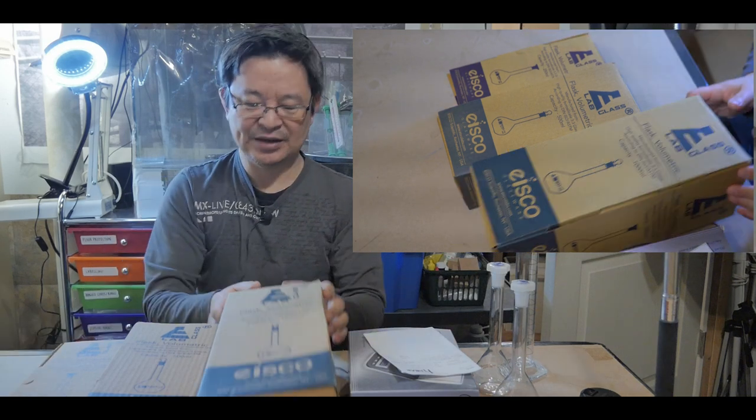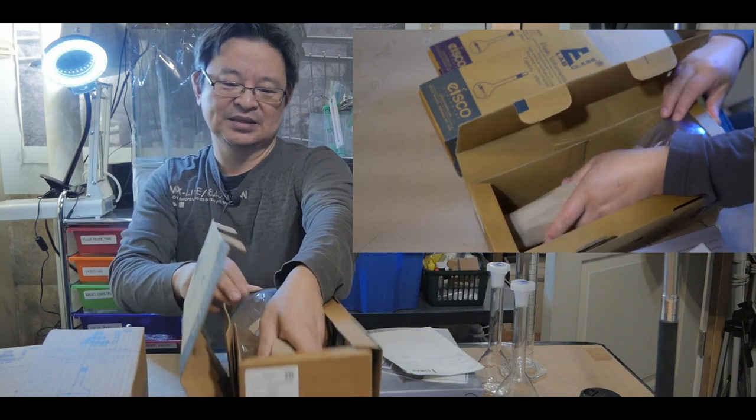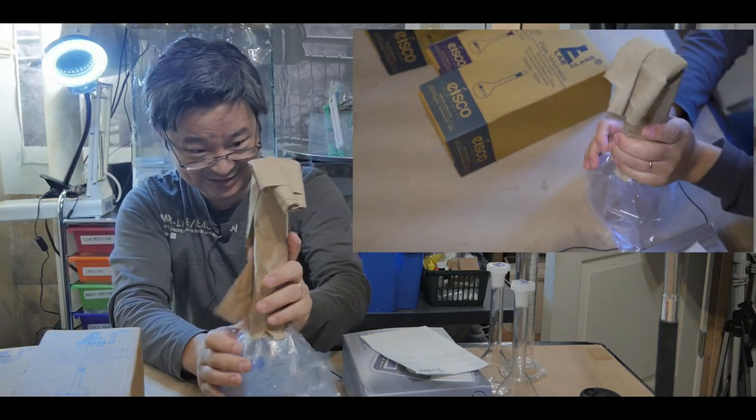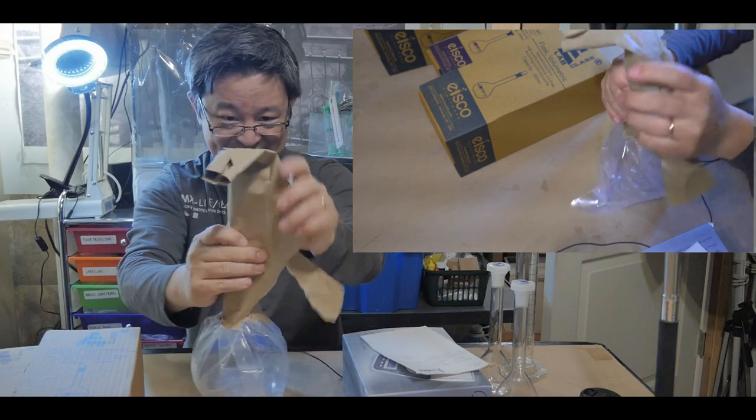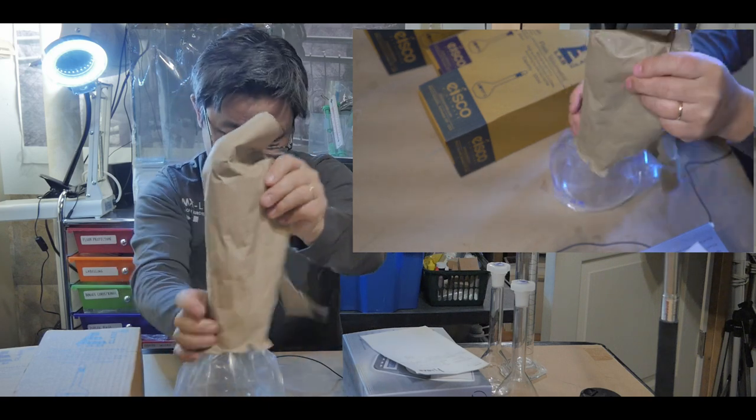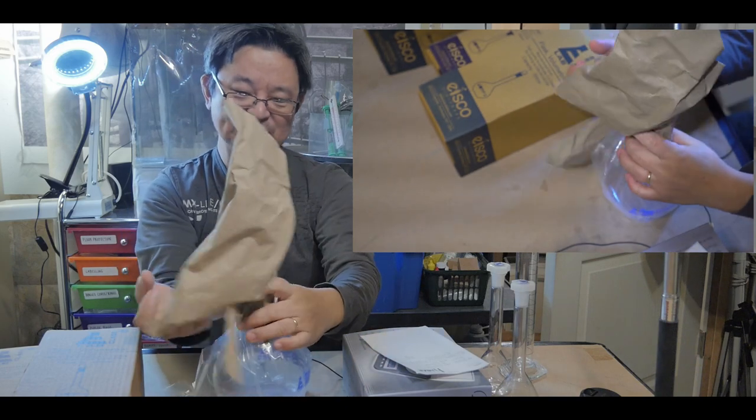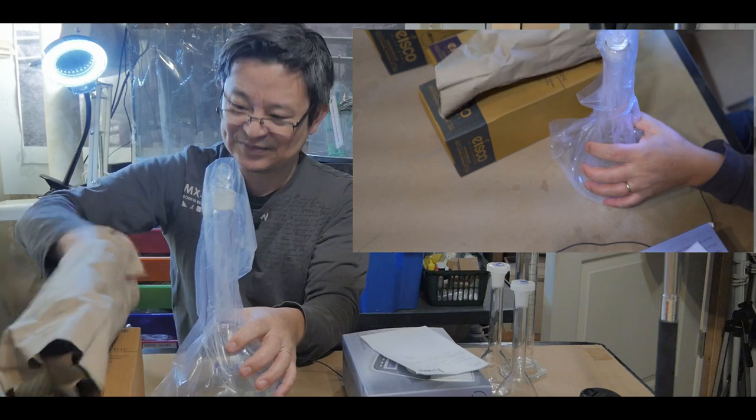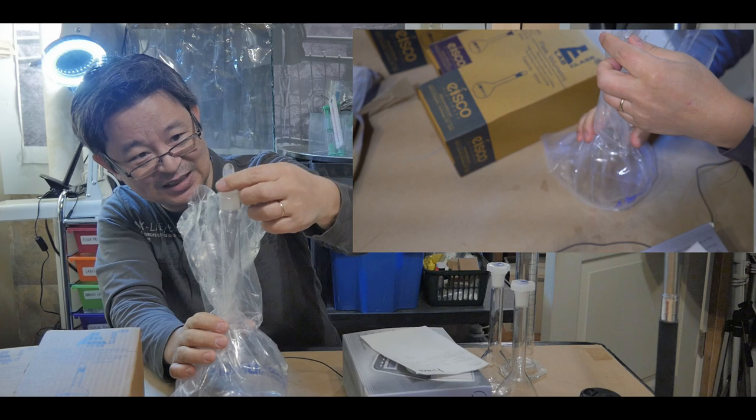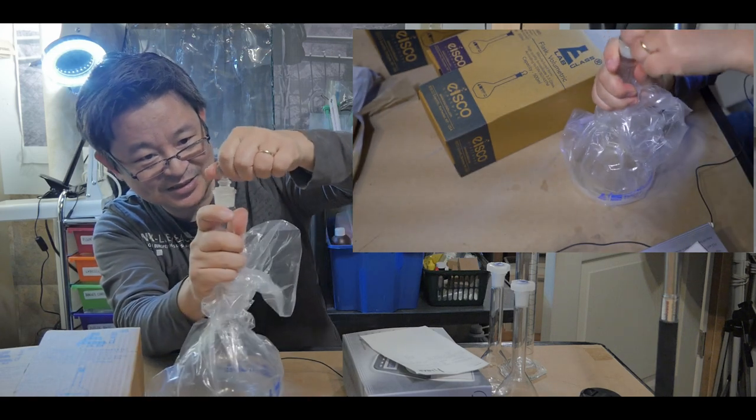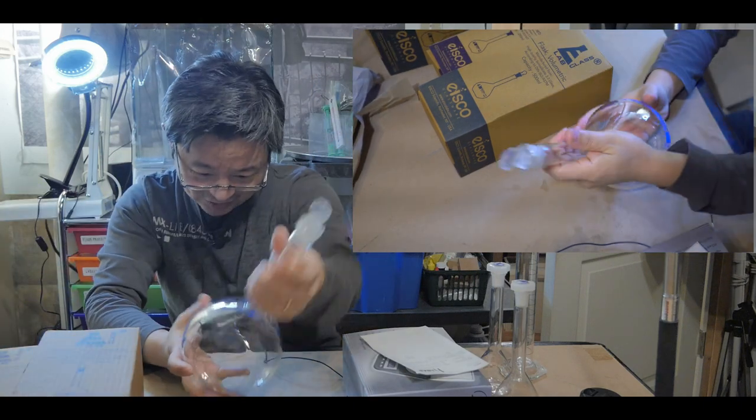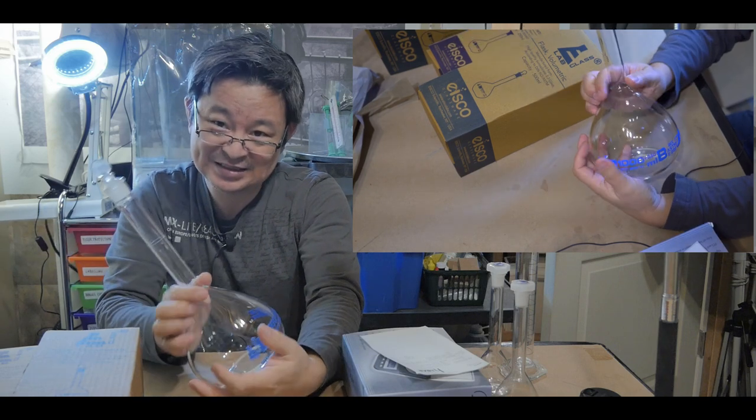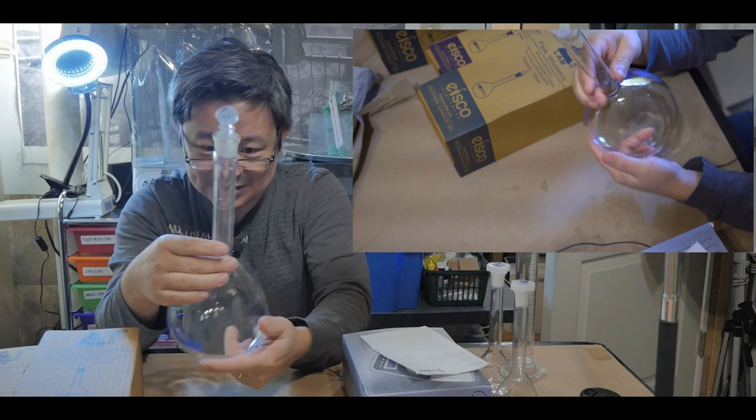Let me show you the 1000 milliliter here. Wow, it's nicely wrapped. I like it. Take it out. Beautiful. It's almost like owning gold, you know. The thing is, people don't appreciate these kinds of things, but I tell you, when there's a short supply of these types of glassware, it's like gold and diamond. They're very hard to come by. Alright, so let's see. Oh yes, now what I like about this one is look at that - they even gave me the nice stopper. It's a glass stopper. Wow, glass stopper, it's really cool. Nice. Oh look at this: 1000 milliliter, plus and minus point six.